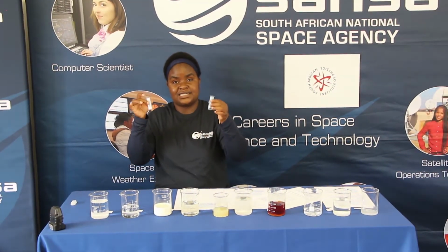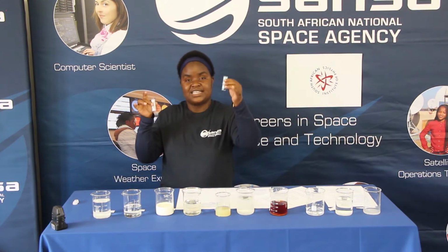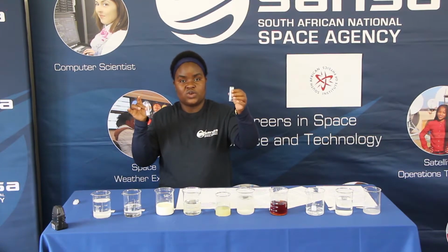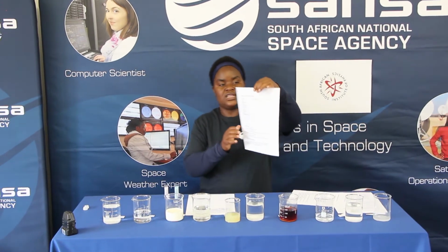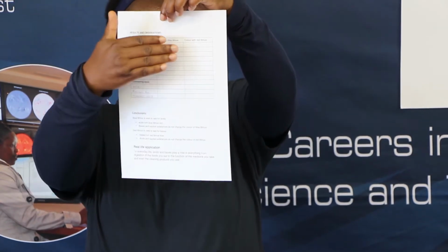How you determine that is if you dip one of these into the solution, it will either change color, or it won't change color at all, or it will change from one color to the other depending on whether it's being dipped into the acid or the base. We're going to record our results on the table. You have a column for the blue litmus paper and then the red litmus paper. I have an assistant who's going to be busy recording these different results for me.